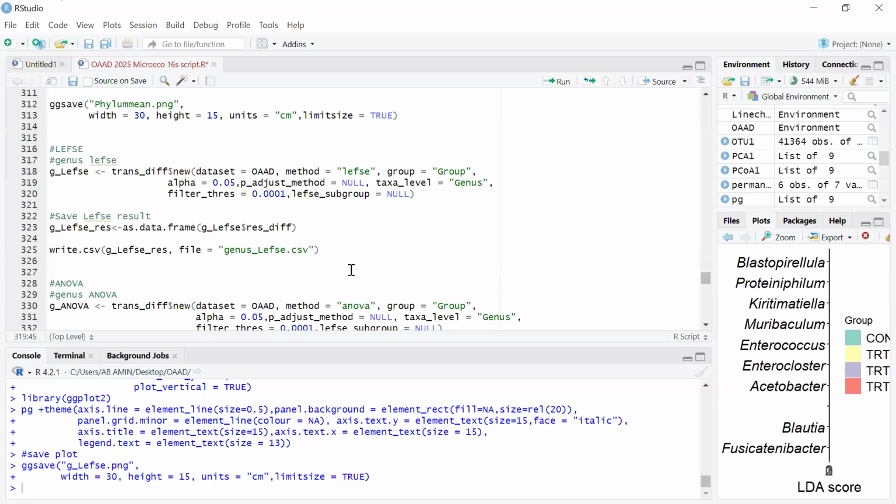But if you look at the way taxa are arranged from kingdom to phylum to order to family to genus to species, for every one of them, if, for example, the phylum is available, you look at the closest that is available. If the genus is not available but the family is available, is it clear? If the genus is not available and the family is available, then it will be unclassified.